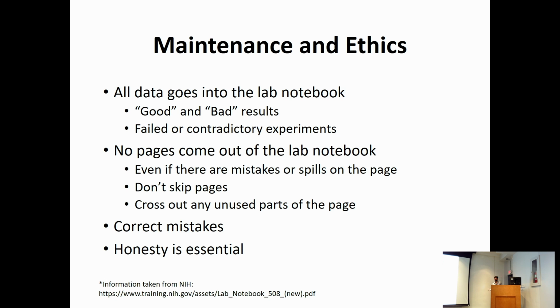And there's no need to skip pages. If you skip pages, you can cross them out, or if there are any unused parts, you can cross them out. So from this slide, all the things that you are doing in the lab, you have to document, even if the results are good or bad. Then you should be very honest.